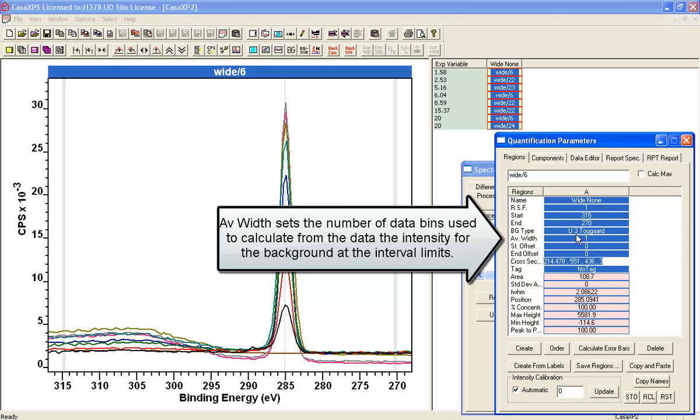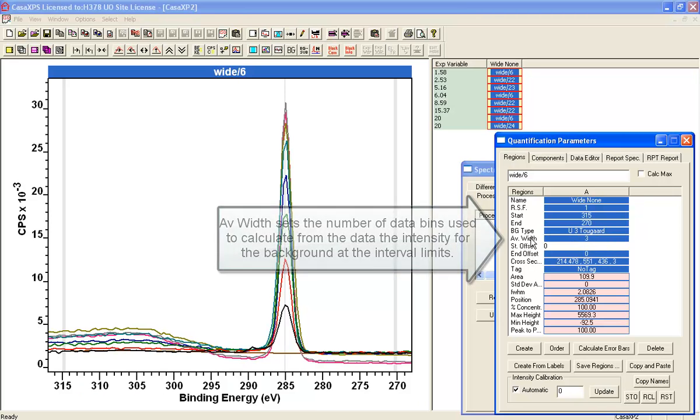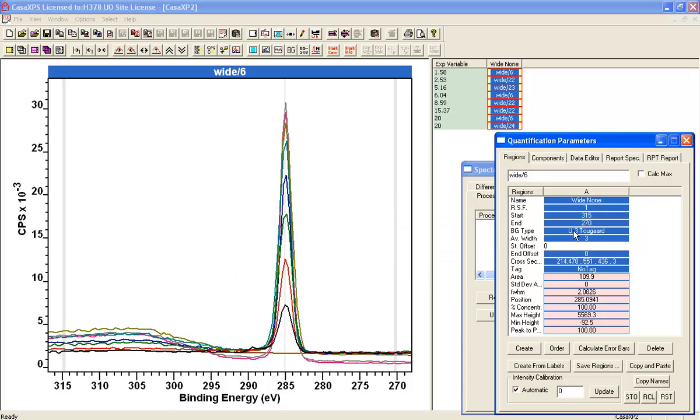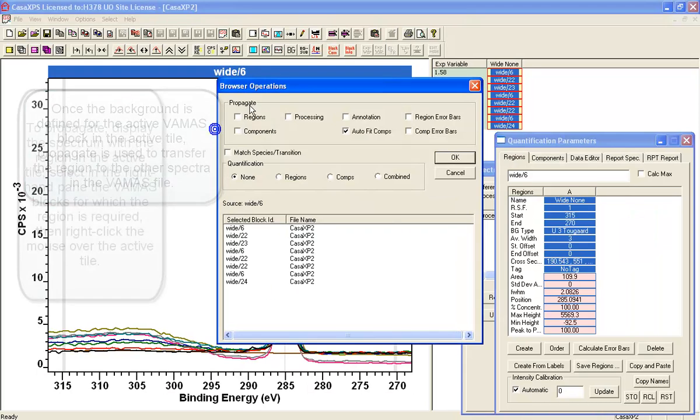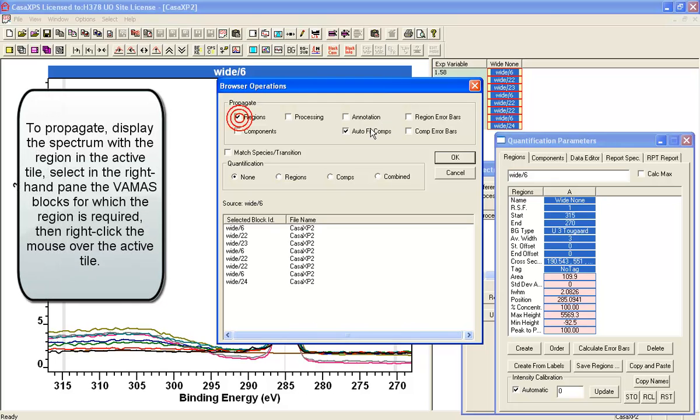I think we'll give an average width of say 3. And that helps to tie the data to the background without too much influence from noise. And I need to propagate this to the other spectra.